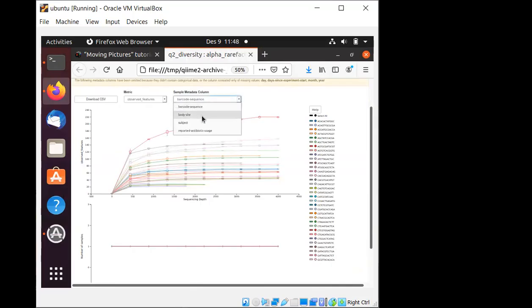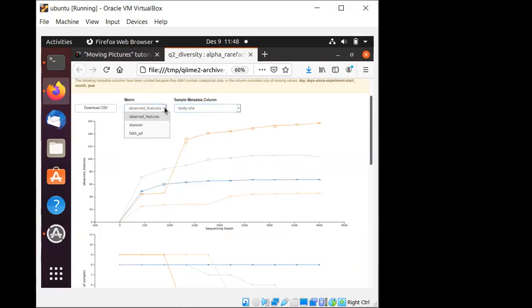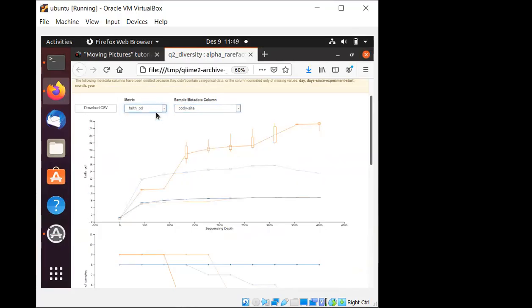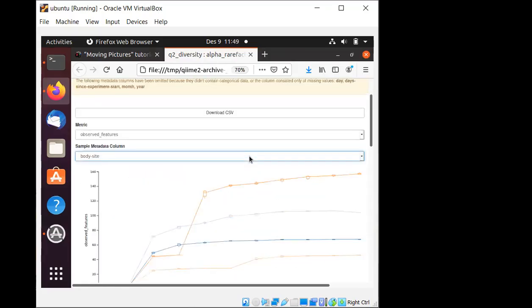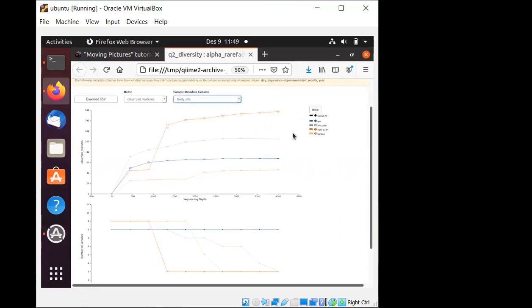So you can see the features, and then the sparsity for each party set. You can see that the tongue actually has a lot more richness in this particular area, with more observed features. Sorry, this one is left palm, right palm. The color is the same.